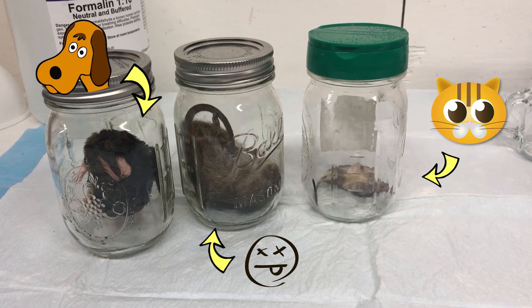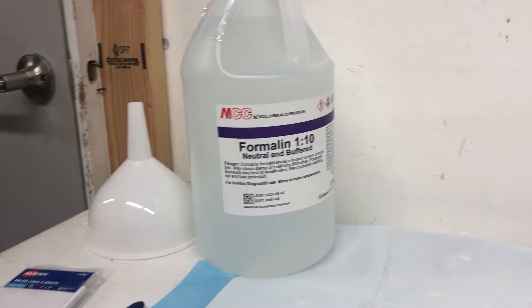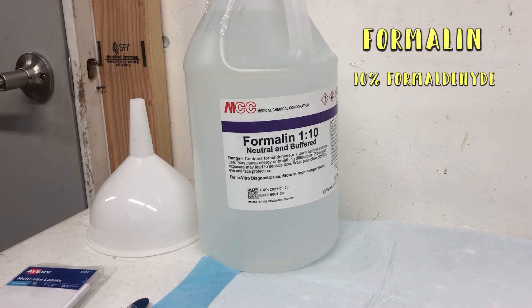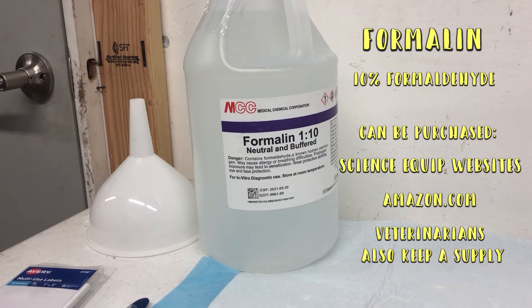Once you have your specimen you'll need to either preserve it right away or freeze it. When you're ready to go, the first thing you'll need is formalin — it's 10% formaldehyde and common in classroom dissections. You can purchase it on a variety of science equipment websites, even Amazon. Veterinarians even keep a supply of it.